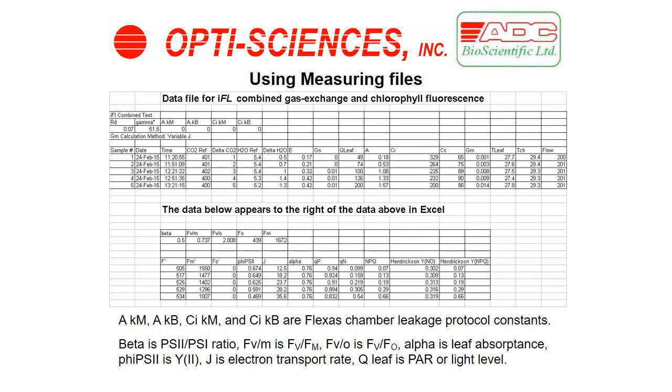Measuring files. The files in the iFL are comma delimited, and so you can open up the measuring files using the data card, putting the data card into the USB adapter and putting the USB adapter into your computer. The files will open in Excel or other spreadsheet systems.